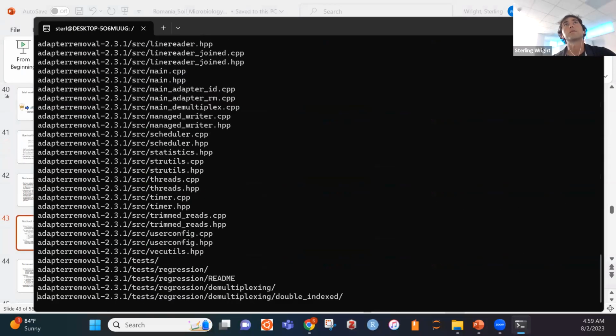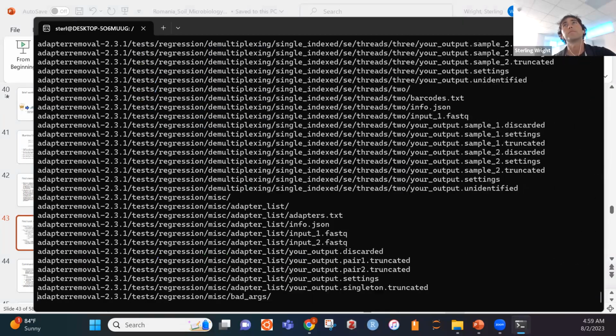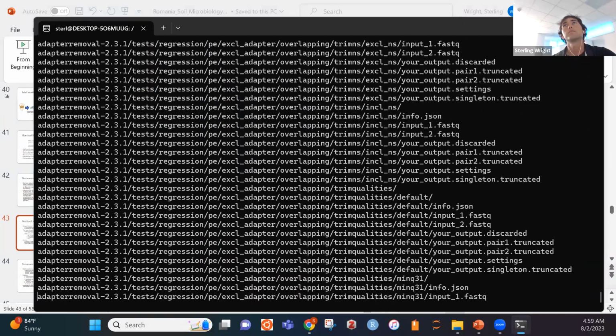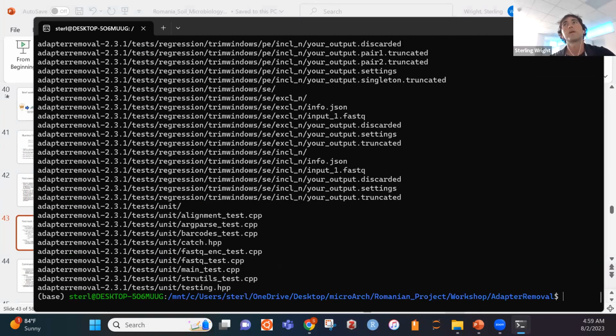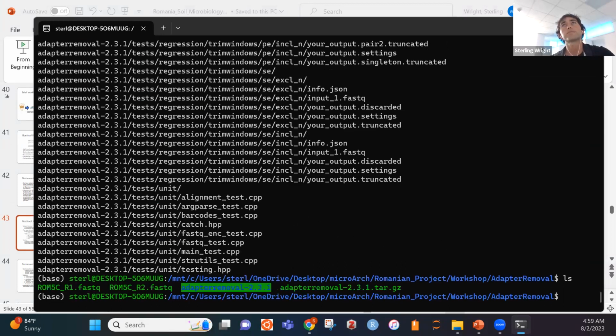I'm going to basically untar, or open up, this zip file. It's basically unzipping the entire file. So now when I do ls, I have 4 files because this one was a gzip file. With gzip, all the things are compressed, which helps save space on your computer. That's useful when you don't need access to it, but when you do need access, you really do need to unzip it so you can access everything you need.